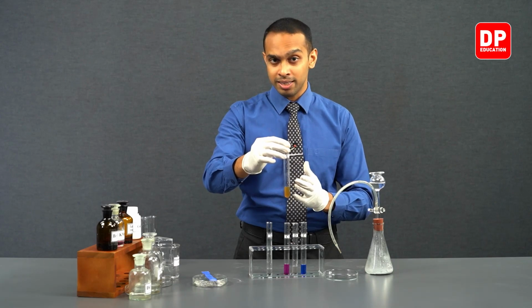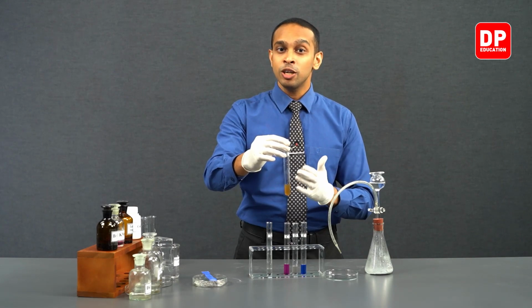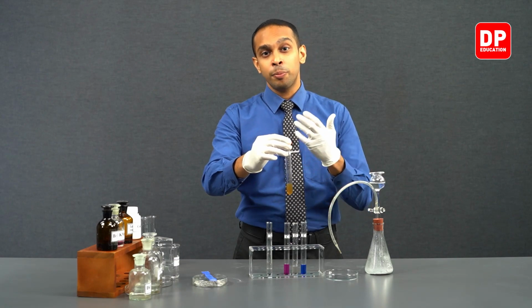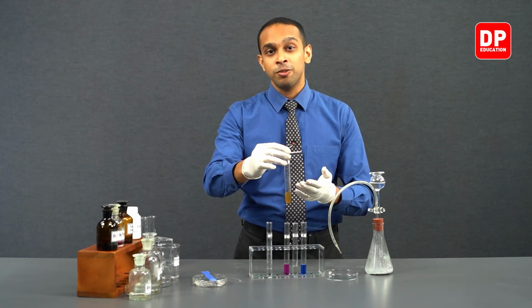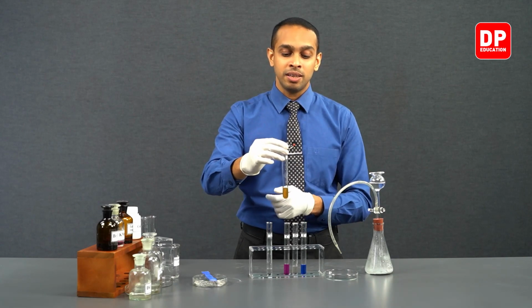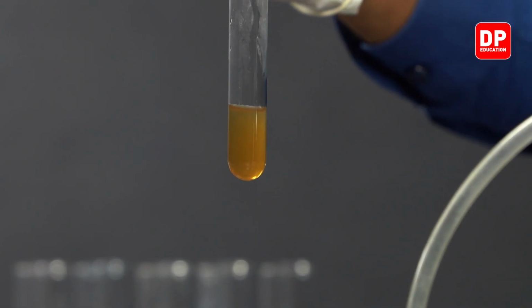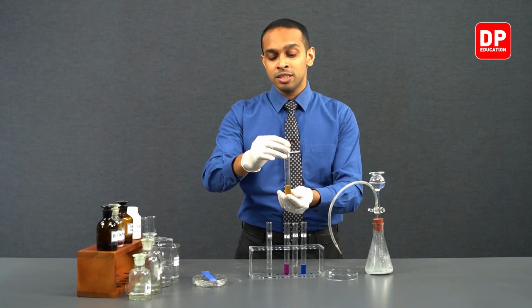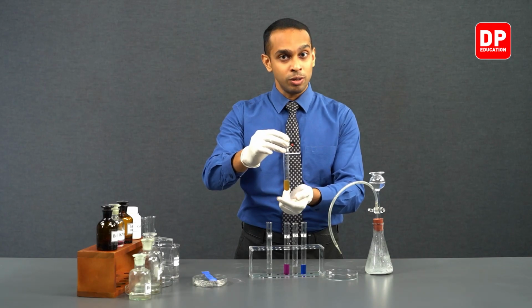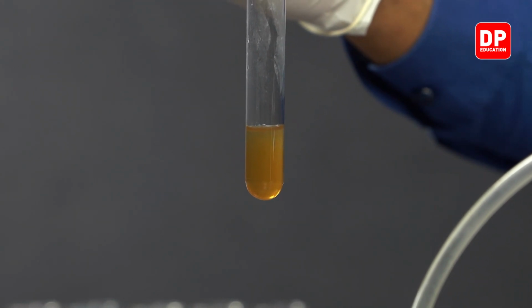Permanganate ions are purple in color. When they get reduced, initially they form the manganate ion, which is a green color ion. So the solution turned green. And upon further reduction, we form MnO2, which is a brown color precipitate. As you can see here, this is a suspension of MnO2 brown color precipitate suspended in aqueous medium. So this is not a brown color solution, this is a brown color precipitate suspended in aqueous medium.